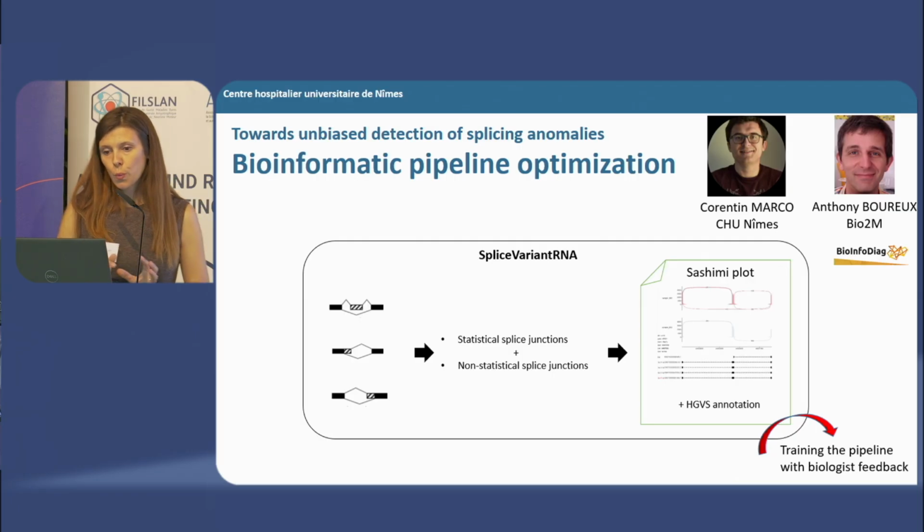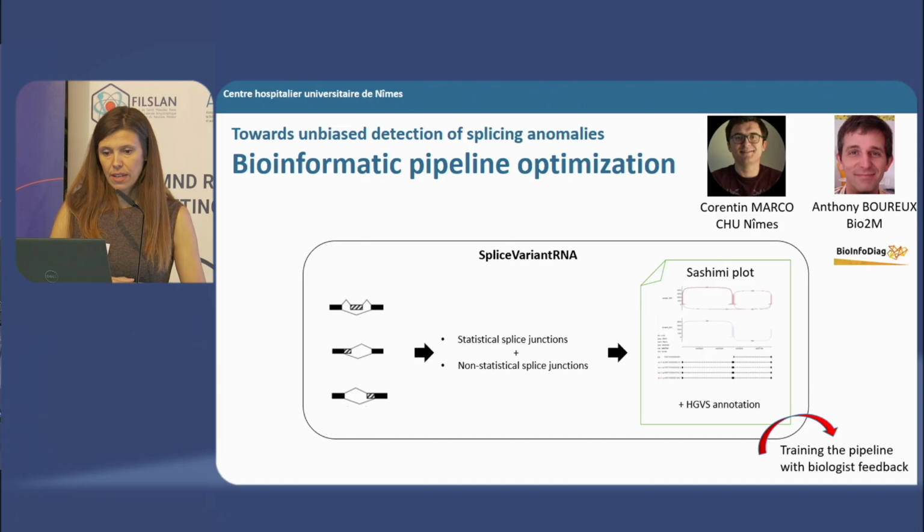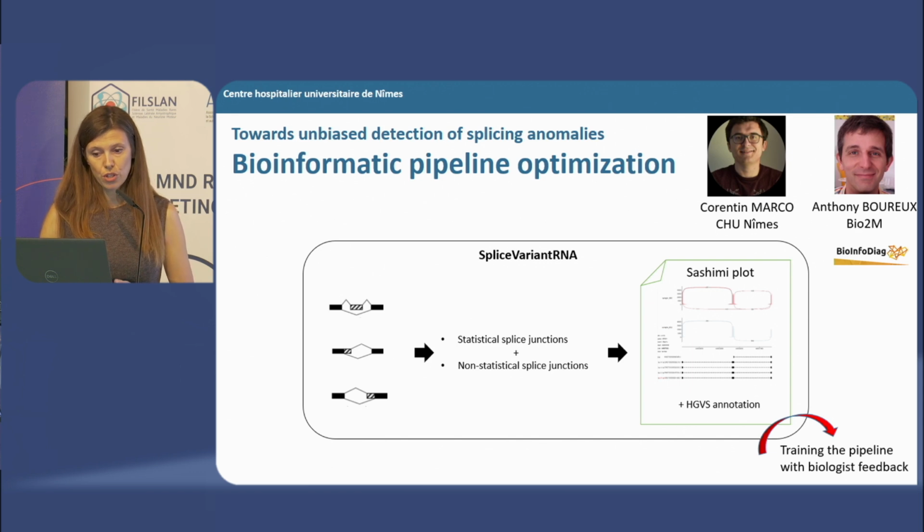And so we developed this tool that combines statistical splice junctions and non-statistical splice junctions and generates automatically a report with a sashimi plot and HGVS annotation.